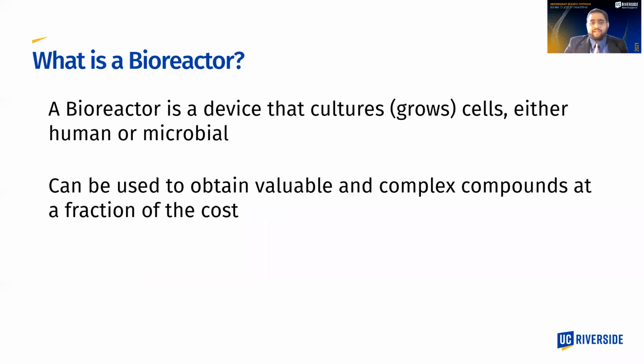A bioreactor is a device that cultures and grows cells using either human or microbial cells, for use either in chemical processes or for growth chambers. And this technology can be used to obtain valuable and complex compounds at a fraction of the cost. A great example of this is alcohol. If you were to synthetically make alcohol, you could, but the cost would be high and the yield would be low. Instead, you could employ yeast and a bioreactor to produce alcohol and simply purify the product.